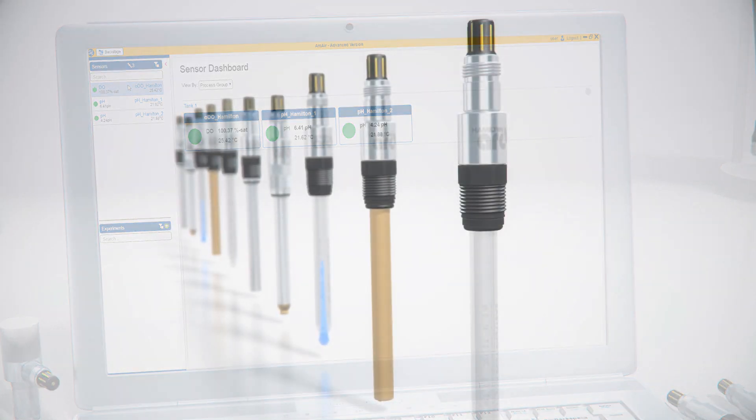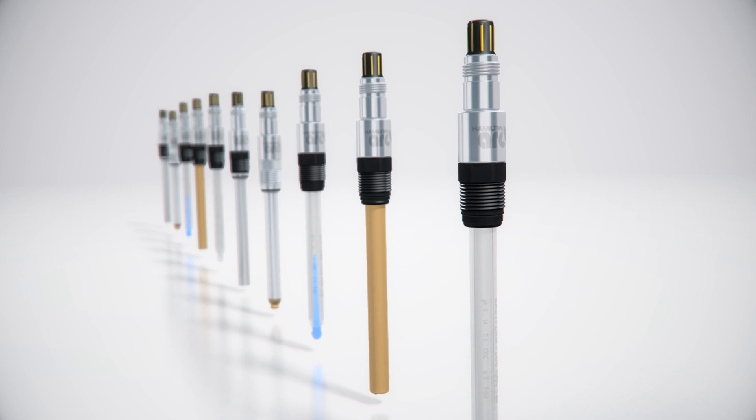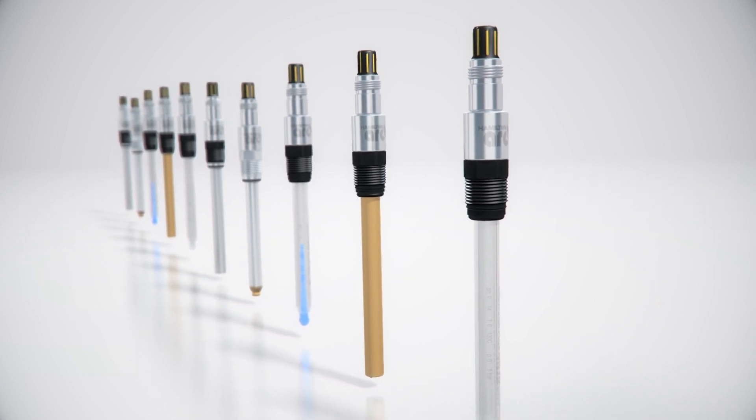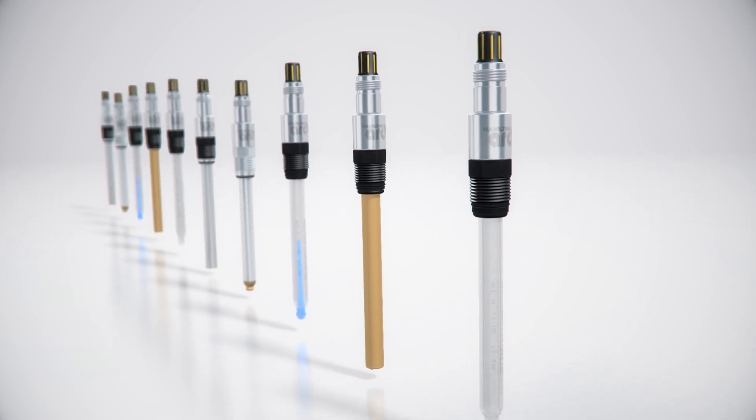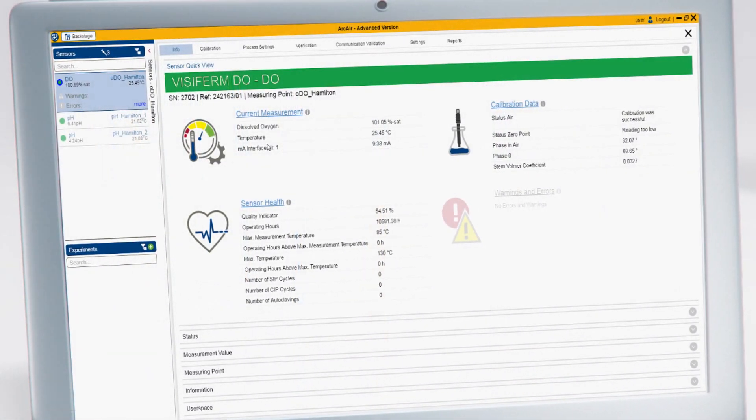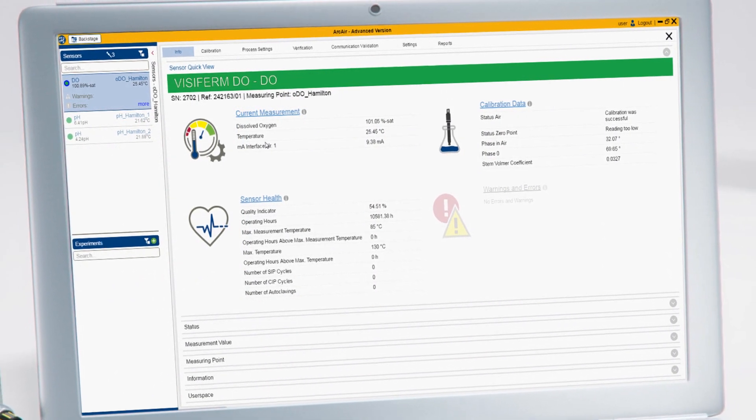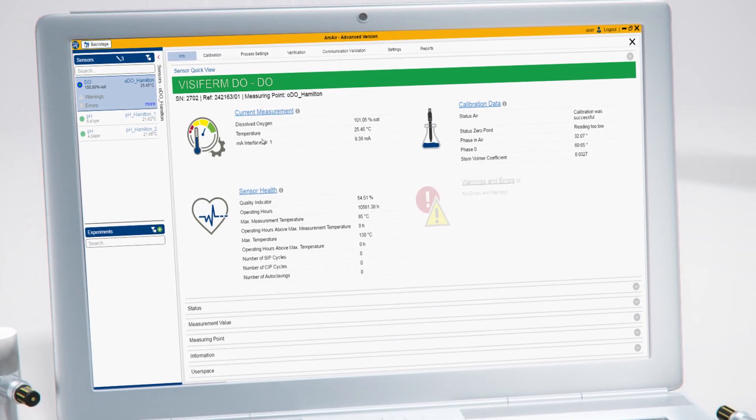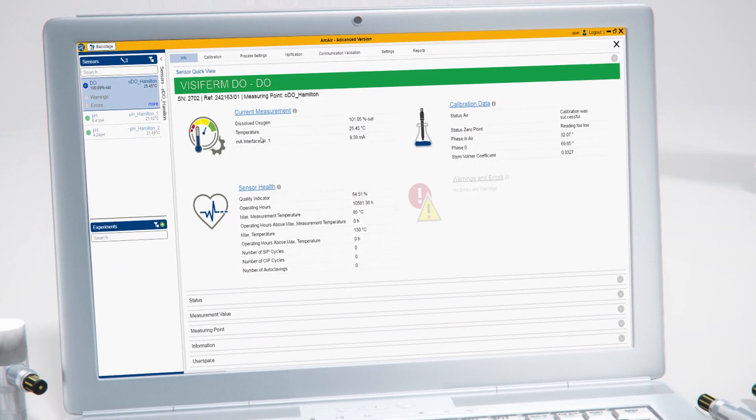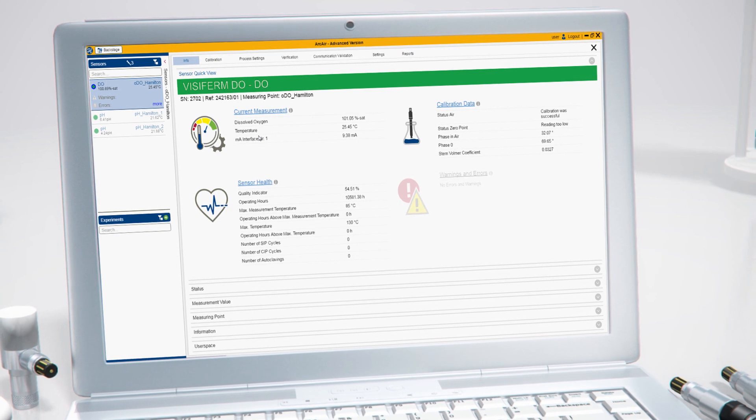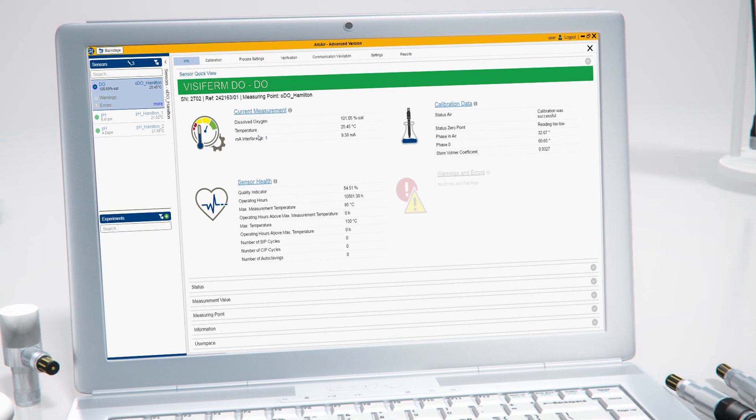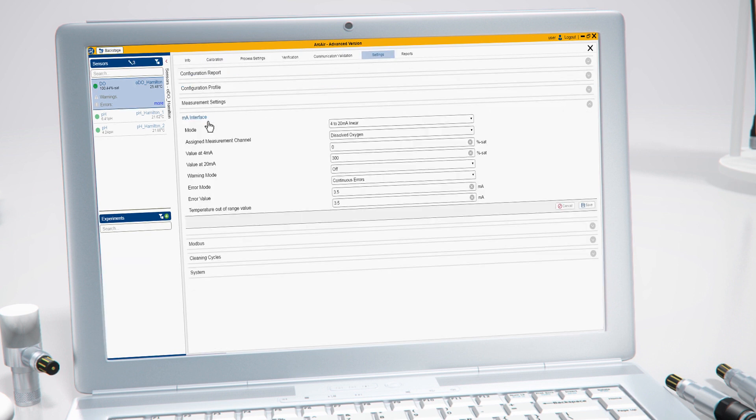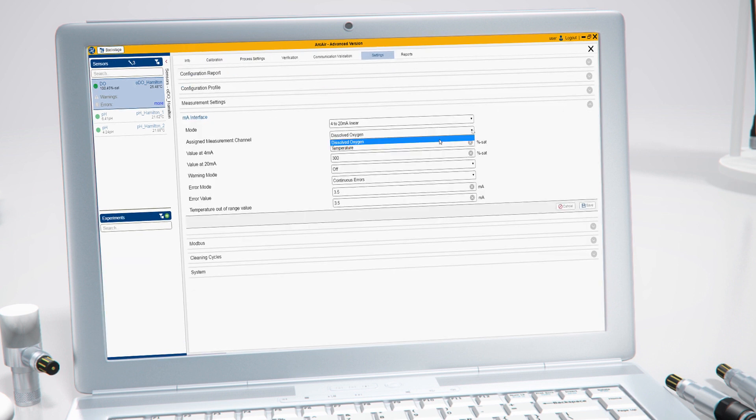As part of the installation process, you need to configure the Arc sensor parameters. For example, if you are using a 4 to 20 milliamps analog interface, it is essential to configure the 4 to 20 milliamps sensor output according to your measuring range. Check the settings menu with the 4 to 20 milliamps interface configuration.